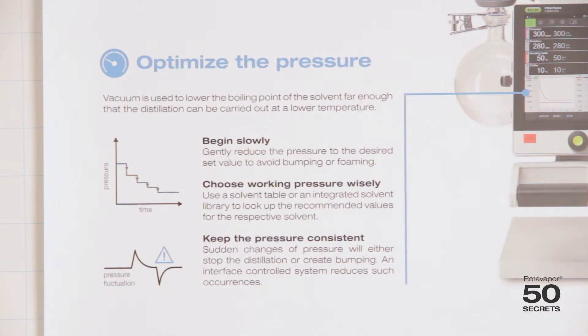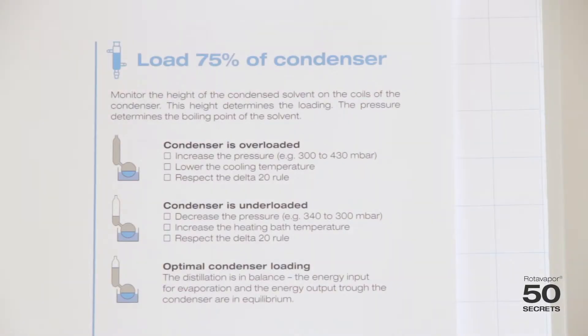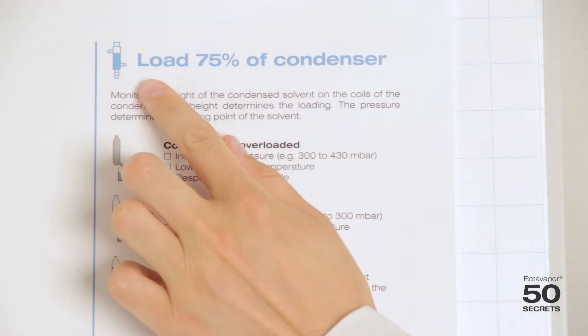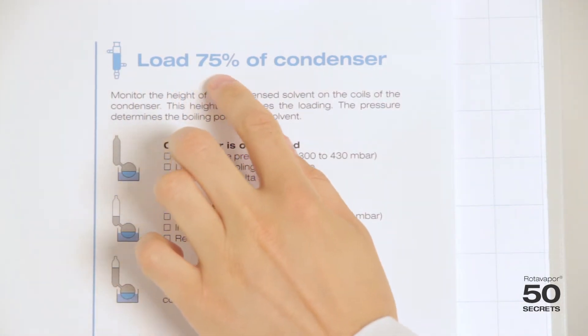Things like using the stopcock method result in big jumps of the vacuum. The third secret is about loading the condenser correctly. The correct loading would be about 75% of the condenser.